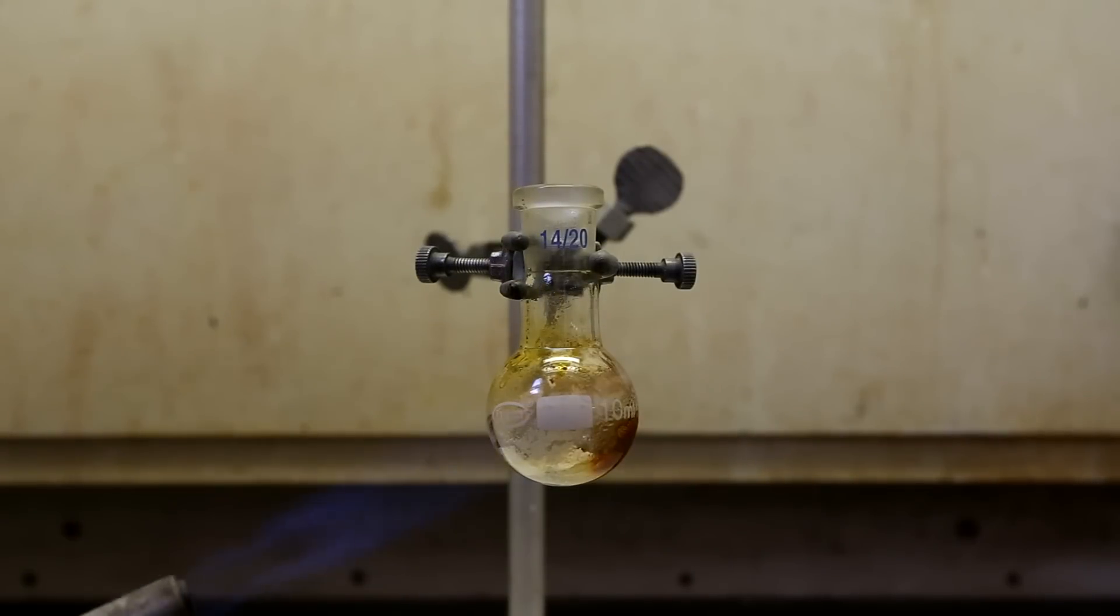I then rotated the round bottom flask so that it could heat the other side. Unfortunately, when using this method, a lot of the powder will remain unreacted. After a while, when it looked like the amount of brown liquid forming had slowed down and almost stopped, I removed the flask from heat.